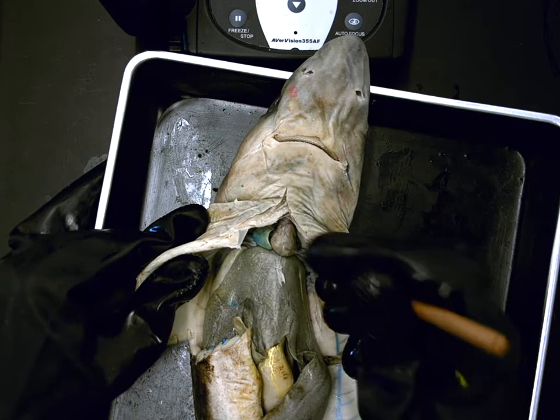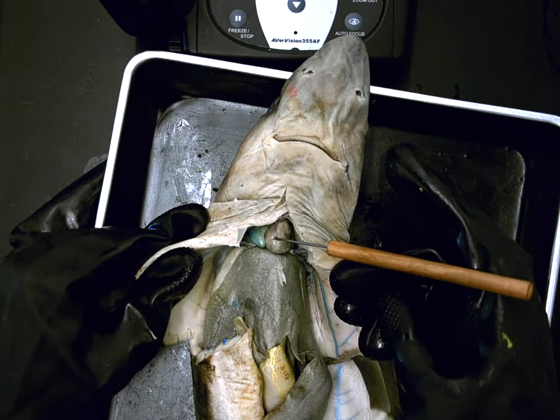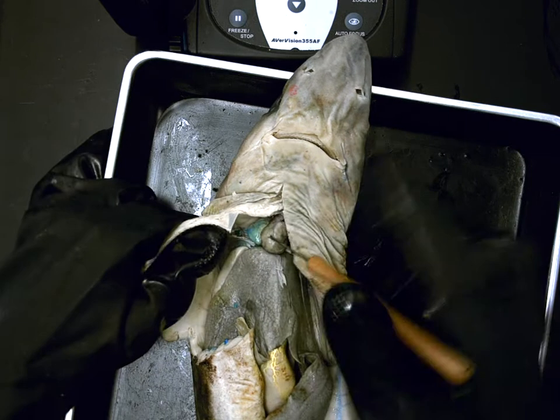Excellent. If I were to stab in here, Marilla, what is this organ? That's the heart. Function of the heart? Pumps blood. Excellent.